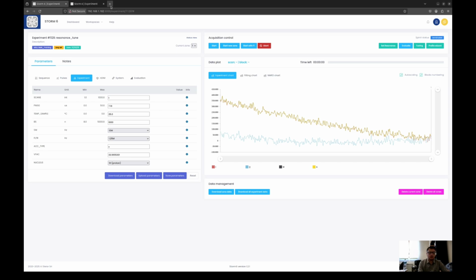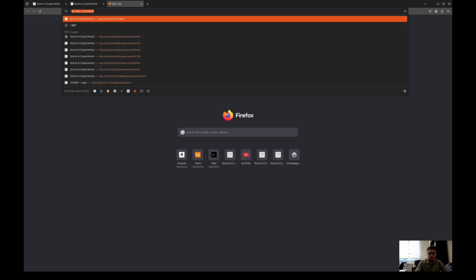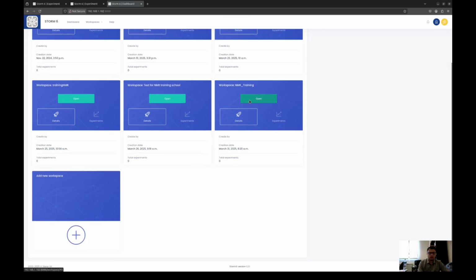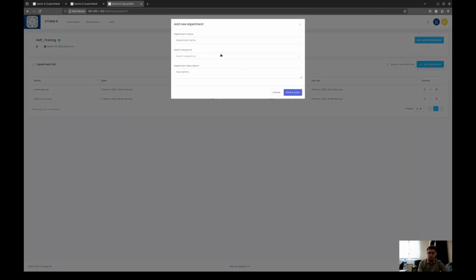So we have performed the basic steps. We have tuned the probe, we have calculated the resonance conditions, we have also calculated the pulse duration, and the next step is to get the relaxation values of our sample. To do this, I will start with NPS.